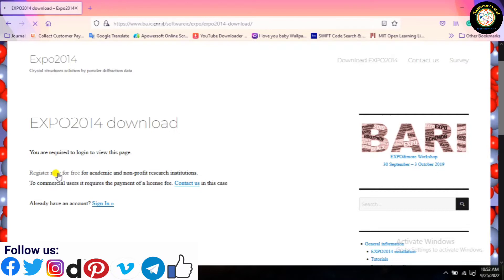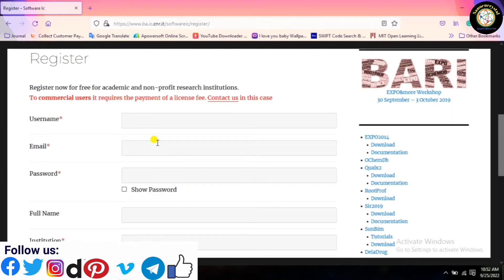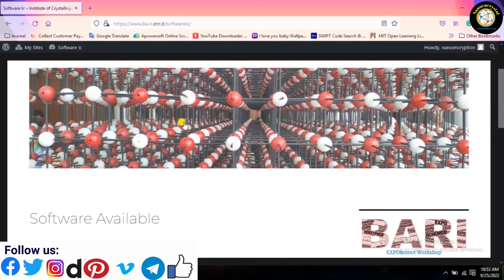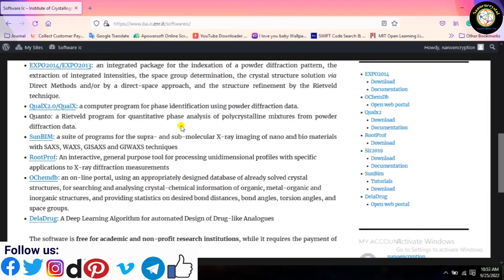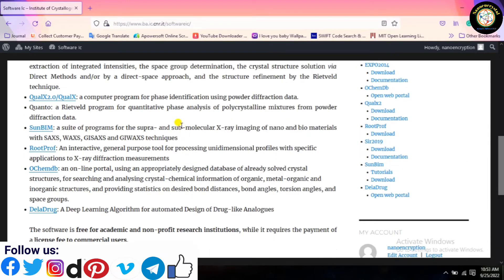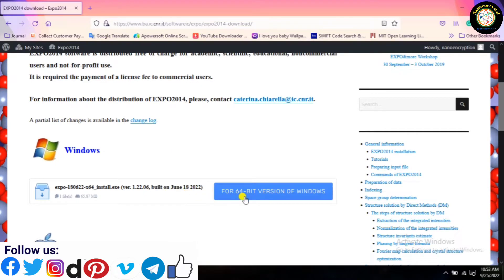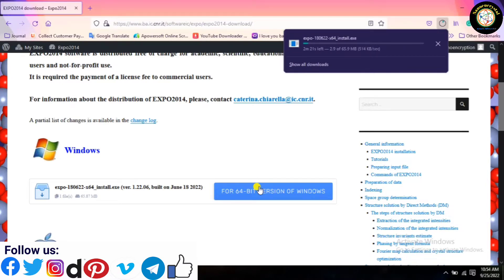Register to download the software. Now, click on the 64-bit version.